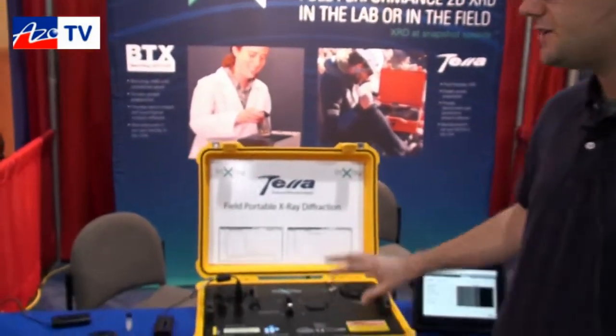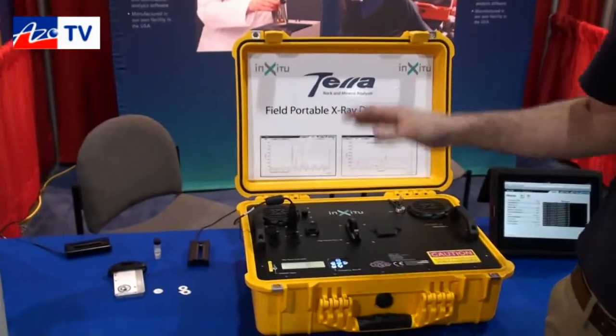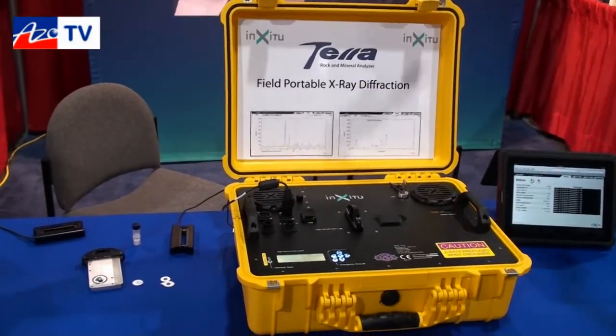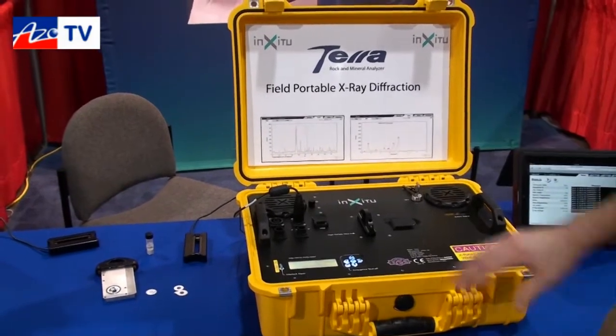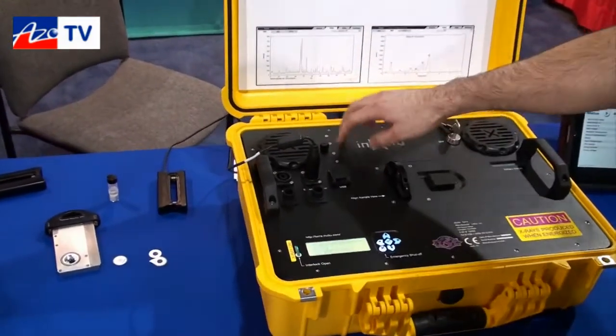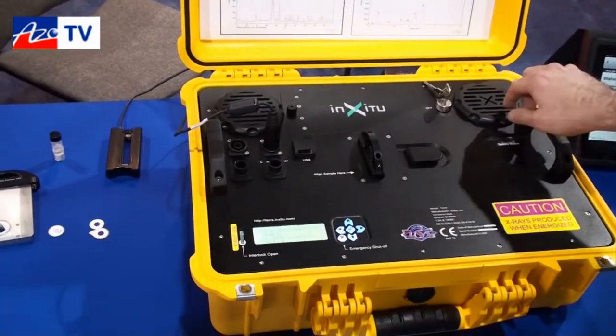Terra is actually a really fascinating instrument — it is the world's first truly portable x-ray diffractometer. Most x-ray diffractometers are very large instruments that take up most of the laboratory. This is a laboratory instrument that you can bring with you into the field. It runs off of four lithium-ion batteries and it weighs about 15 kilograms.